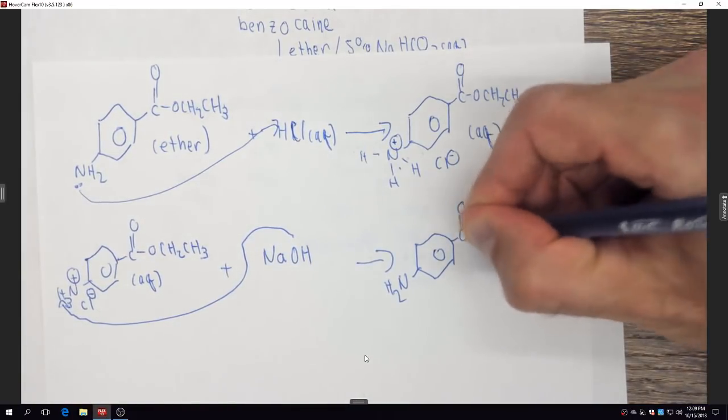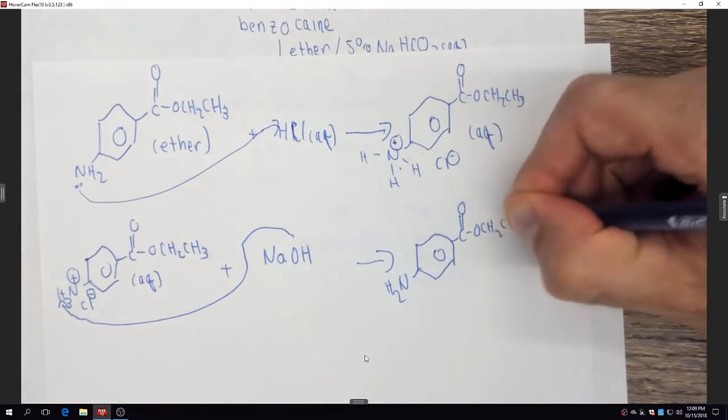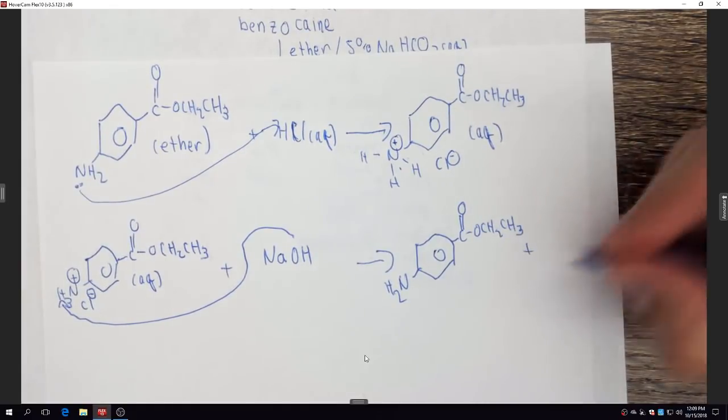This part just goes along for the ride. The ring and the ester go along for the ride. And you get water and salt.